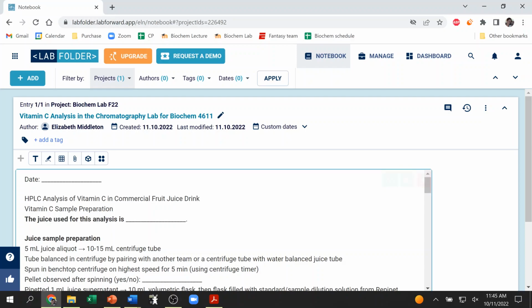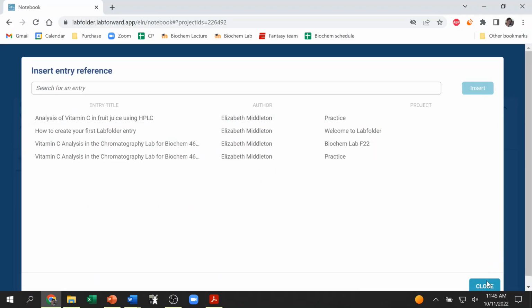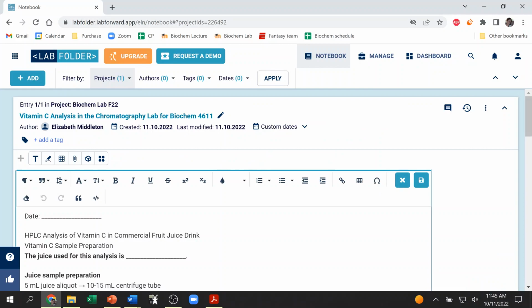Right, so I cut that from here and I put it as the title. Now I'm just going to play around with the formatting a little bit. So let's center this, make it, oops, wrong one, sorry. Let's bold this and center it.